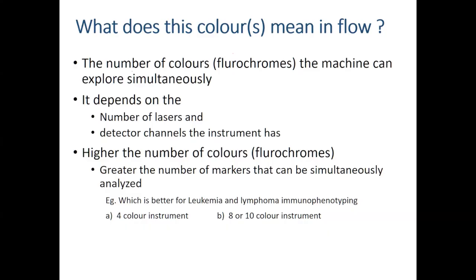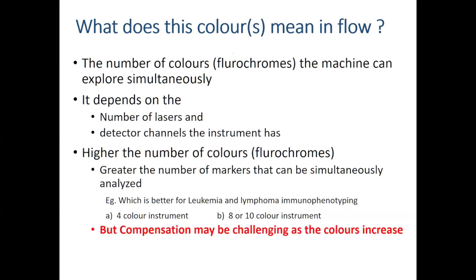When you go for multiple lasers, you need to be a king of compensation setting, because there will be a lot of mixing. You should do a good compensation workup. You also need to do post-acquisition compensation, right? Compensation may be challenging as color increases. So never be too excited that I'm using 40 color. You should be very good at doing the compensation. In spectral flow it's a different story. Their unmixing can be done automatically, but here in conventional flow you need to do your own compensation.